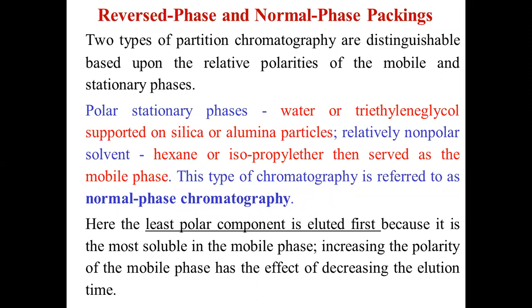If you look at the property of the stationary phase, the stationary phase is going to be polar while performing normal phase HPLC separation. The stationary phase is going to be polar while performing normal phase operation.